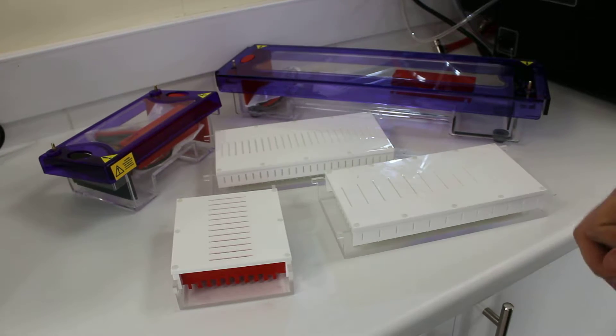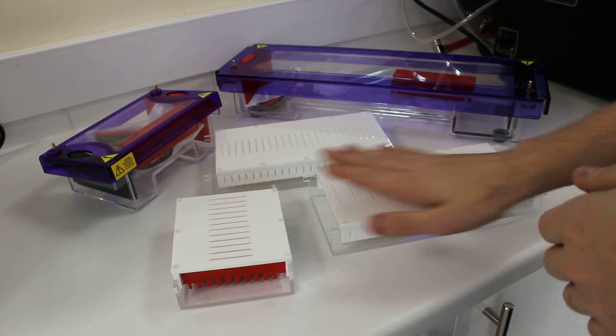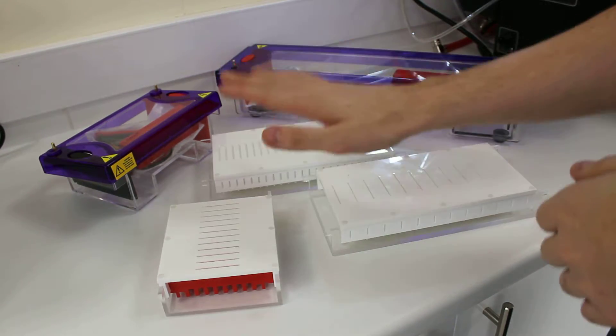This is a short video to show the difference between our 96-well electrophoresis systems. We have three different comb blocks and two different tanks.